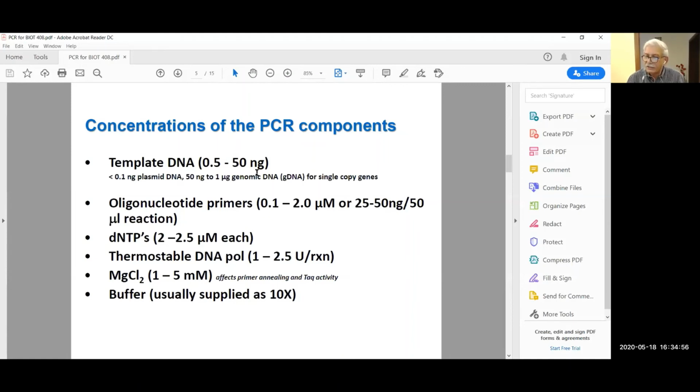How can you do that? Who will tell you the amount of DNA per nucleus? Just go to Google and ask, amount of DNA per cell in cotton, amount of DNA per cell in wheat or some other organism, and you will get the answer. So all these values are known. You need to get 1,000 copies, and that is very essential for a good PCR amplification.